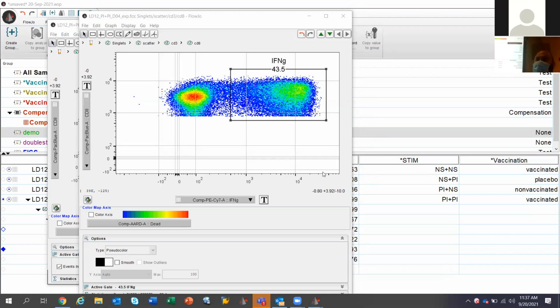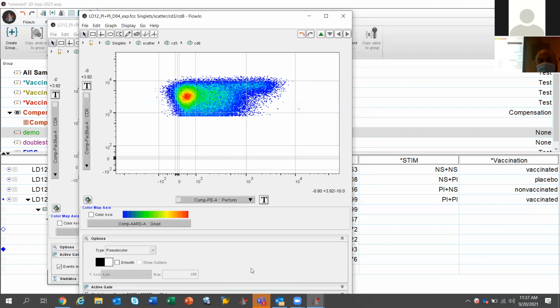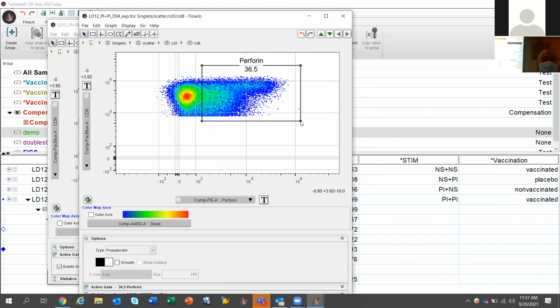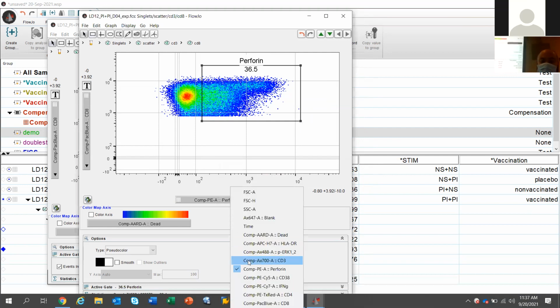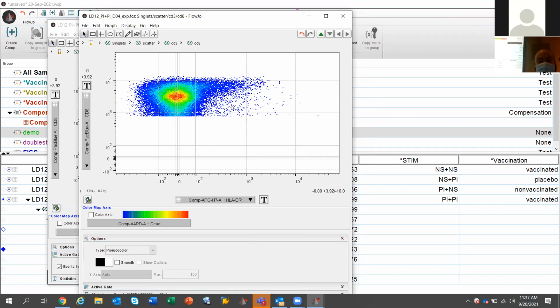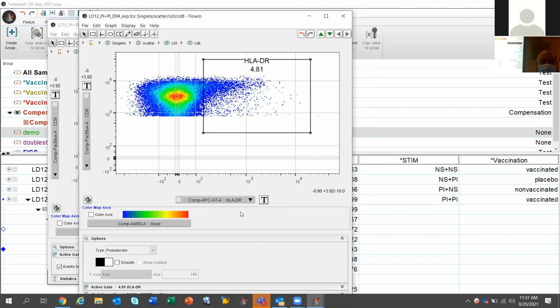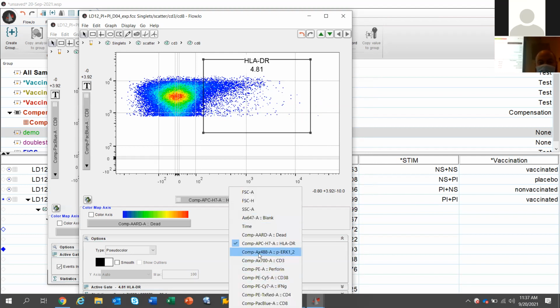So how do you negate that and reduce the amount of labor? Select the parameter of interest. In this case, I just selected cytokine production. Next, I'm going to select degranulation. And again, I should be using an FMO to create these gates, but we're limited in time, so I'm not doing that. This is not a real analysis, but you should be doing it with your FMOs. So degranulation, immunoactivation, so I'm just selecting the positive gates. That's all I'm doing. And phosphorylation.